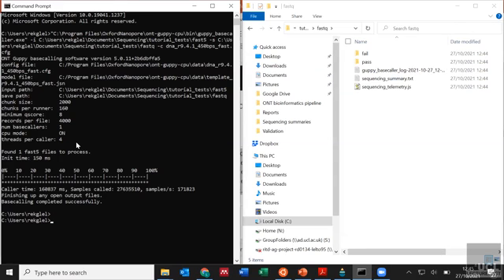It's in the PDF, but your computer might have a sticker on the front that says, so mine says Intel Core i7. You can also identify it in the settings on the computer, but I believe that mine could in theory do 7 parallel things at once.